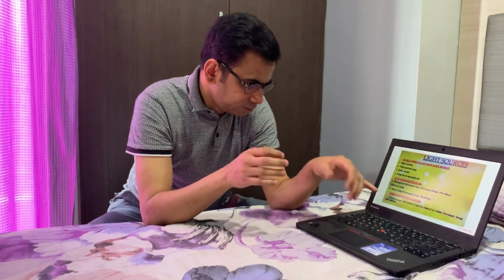So what could be the different light sources? As I told you before, if it is UV, it could be the hydrogen lamp, deuterium lamp, the mercury lamp, and the xenon lamp, and mostly they can measure the sample in the range of 190 to 420 nanometer. If it is visible, the tungsten lamp measures both the UV and the visible range, from 300 to 1250 nanometer. So these are some simple photographs: the deuterium lamp, the mercury lamp, the xenon lamp, and the tungsten lamp.